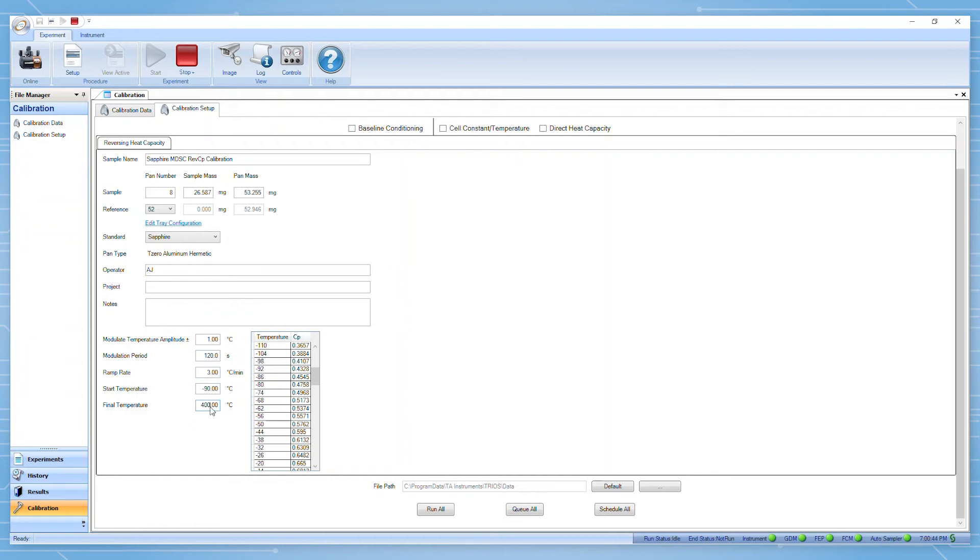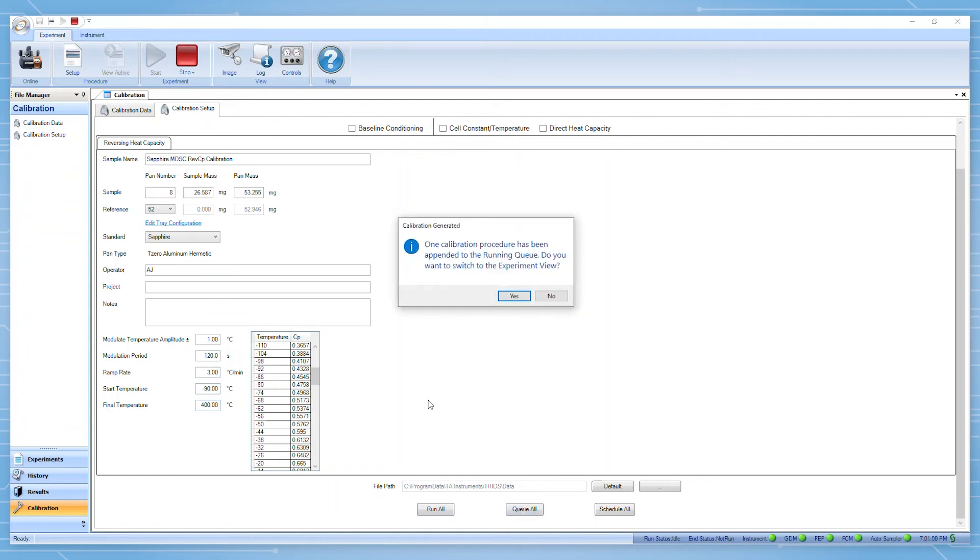At this point, you can choose to immediately run, queue, or schedule the calibration experiment. If we select queue all, the experiment will be sent to the running queue which we can then see in experiment view.